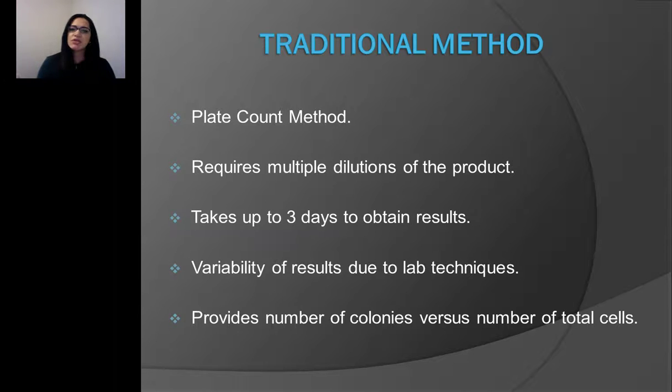So just to tell you a little bit about the traditional method, it's the plate count, and it usually requires multiple dilutions of the product, because usually the product comes in powder form or freeze-dried form, and therefore it requires different dilutions.